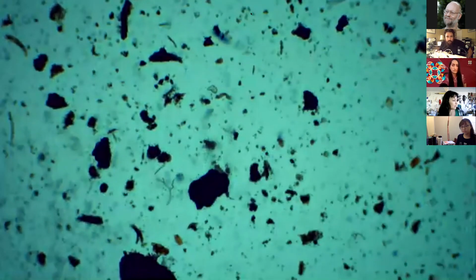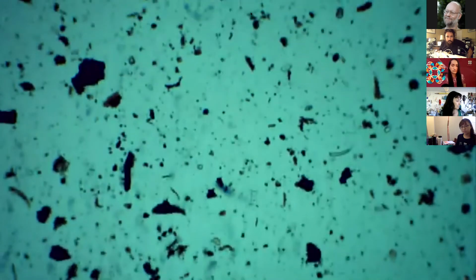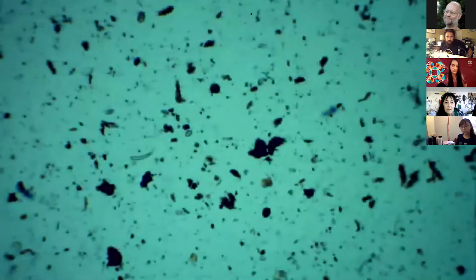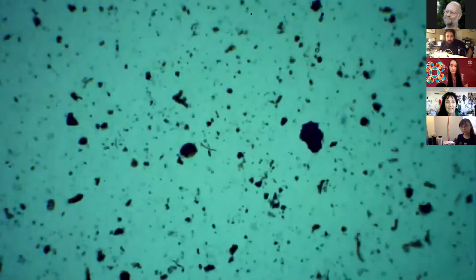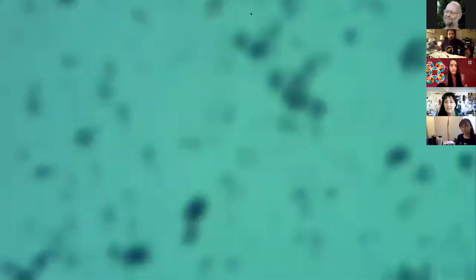All right, so let's take a look here. See if everything's wiggling around. All right, so let's go from 40x to, let's step it up to, let's go to 100.